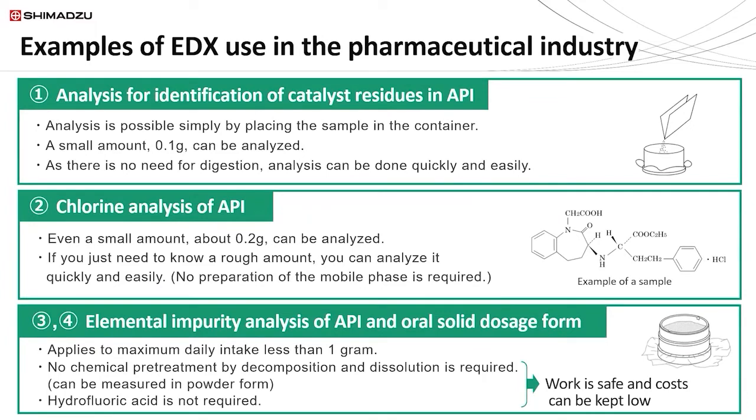Okay, so this is a synopsis of some of the applications I'm going to show. XRF, in the United States and in fact in the world, is a massive market. XRF is used in a variety of industries outside of pharmaceuticals, for example in agriculture, geological applications like mining, cosmetics, OEM, and so forth. And even within the pharmaceutical industry, there are more applications than what I'm showing today.